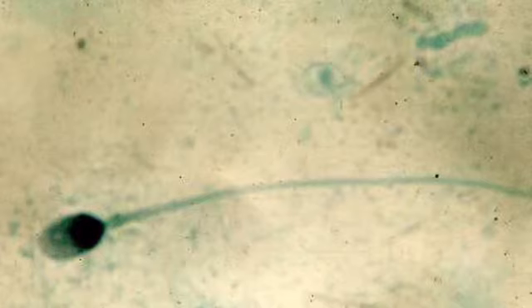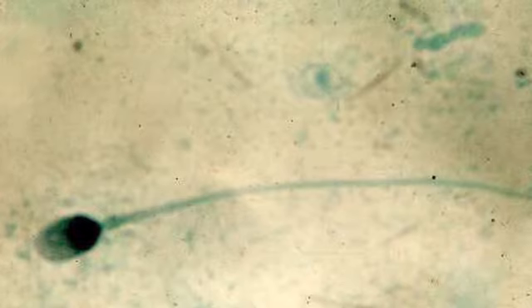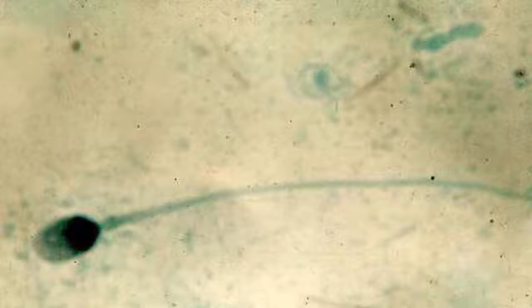If they find the sperm cell, then it's identified as semen. There are, of course, other animals that produce sperm, but none that I've seen look just like human sperm cells, or they're slightly different size or shape. So that's a pretty powerful identification tool, is to say, well, there's a sperm cell, so that means it's semen.